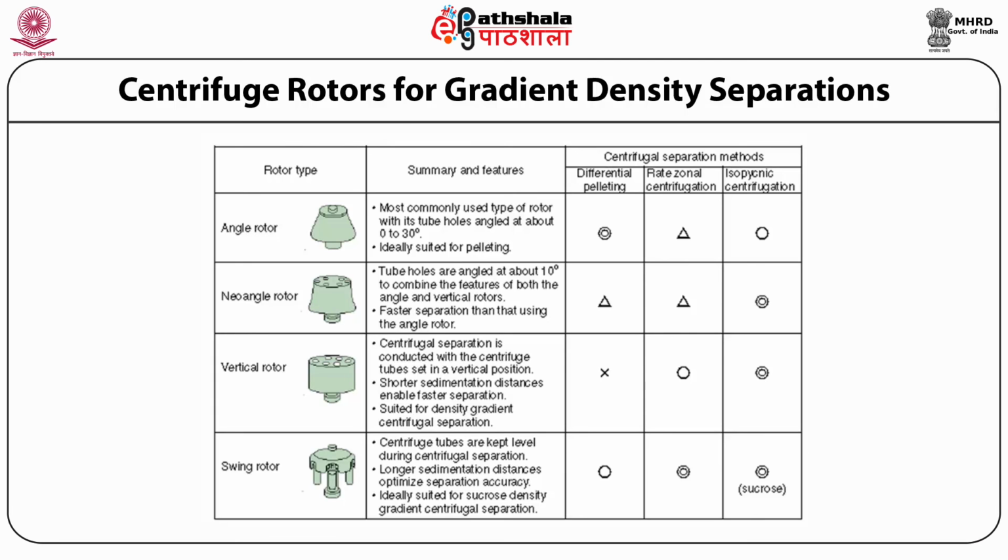Then second is the near-vertical rotor. Near-vertical rotor tube holes are angled at about 10 degrees to combine the features of both the angle and vertical rotors, giving faster separation than that using the normal rotor.